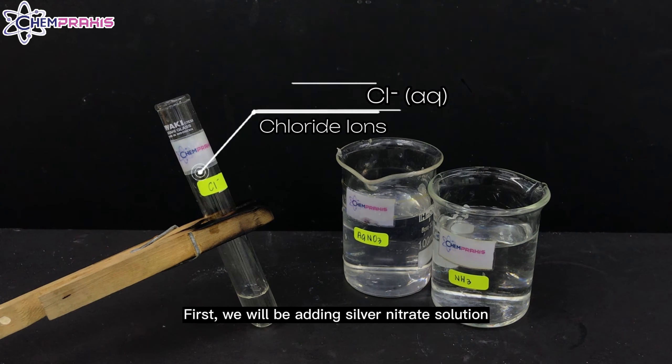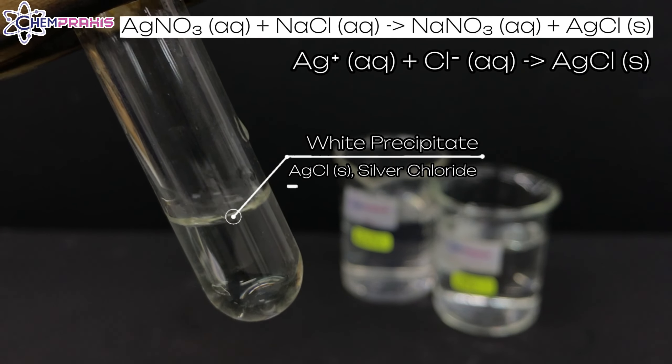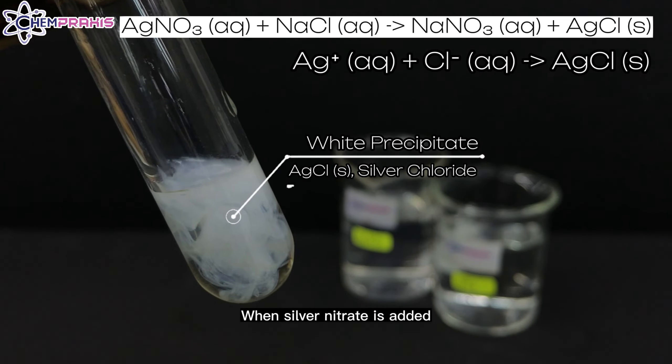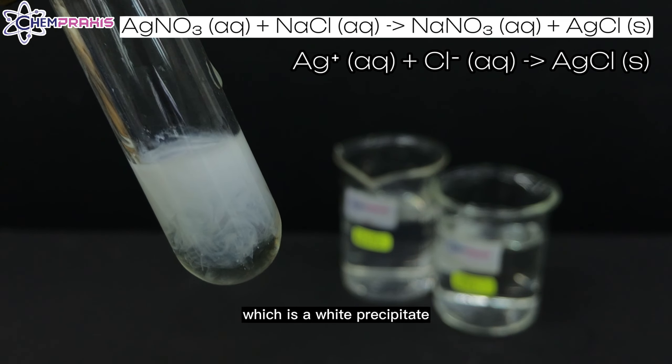First, we will be adding silver nitrate solution to the chloride solution. When silver nitrate is added, a white precipitate forms. The silver ion reacts with the chloride ions to form silver chloride, which is a white precipitate.